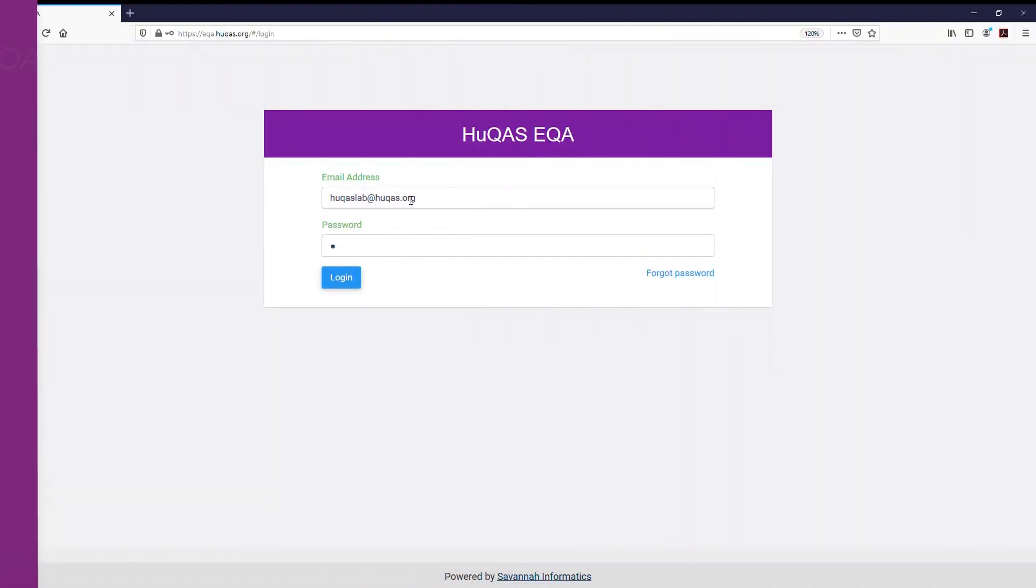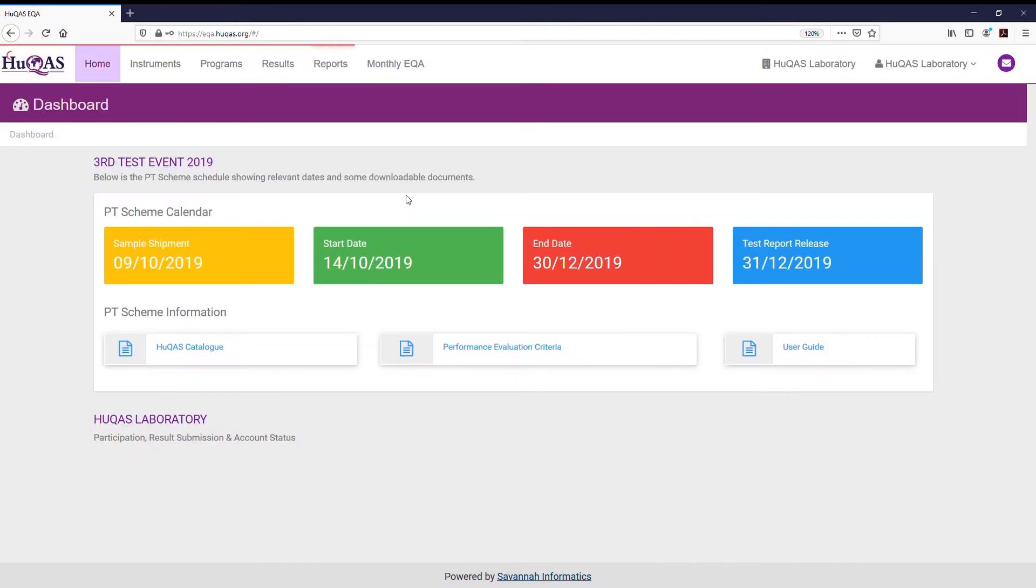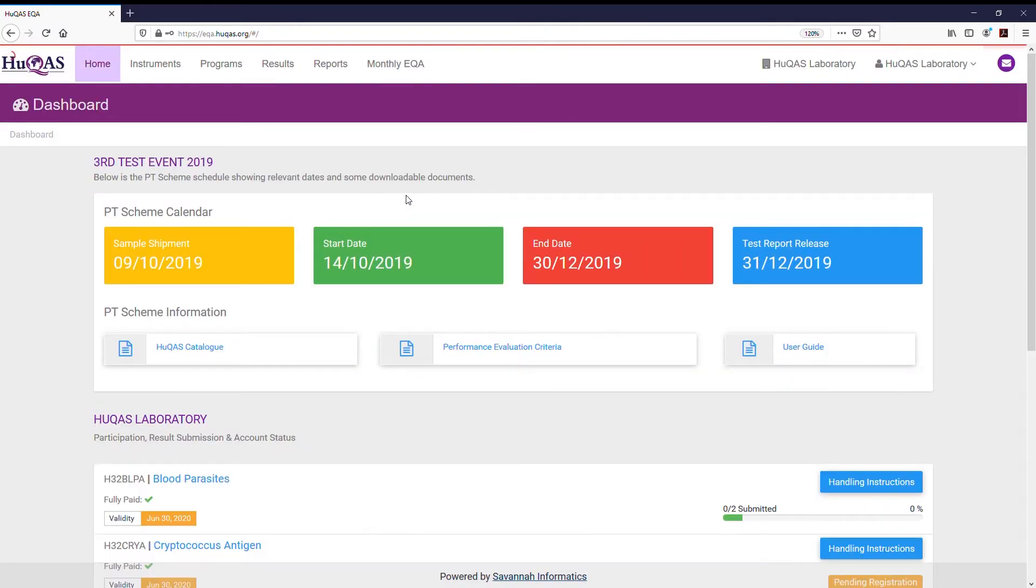Welcome to the Hucus user guide on how to manage users in your lab account. Log in to your Hucus EQA account.